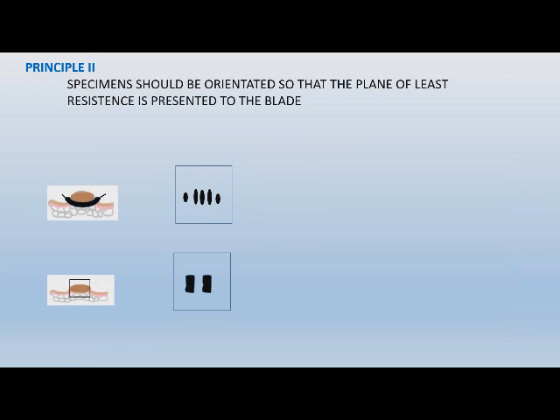You're going to see that the same formula goes throughout. But I don't know if this has ever happened to you: on occasion, when I've cut up through a shave biopsy like this, and they certainly can be much smaller than what's represented here, I've peeled up an edge and popped a piece out. That has happened to me more than once. So what we might want to recommend doing is try something else. But first, before I show you that, I want to show you this little guy right here.